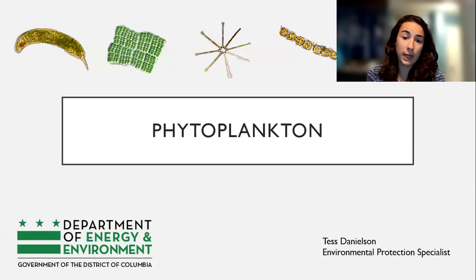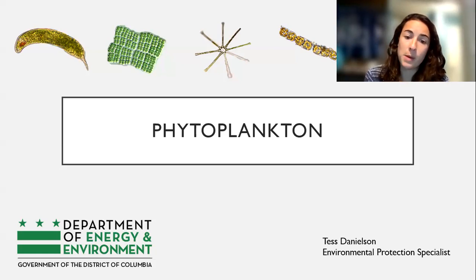I'm an environmental protection specialist for DOEE, and I work in the monitoring and assessment branch in the water quality division. So today I'm going to give you an introduction to our phytoplankton monitoring program, as well as go over some of the lab methods that we use for phytoplankton analysis. So before we get started, I'm going to minimize my video here so you all can see the slides.